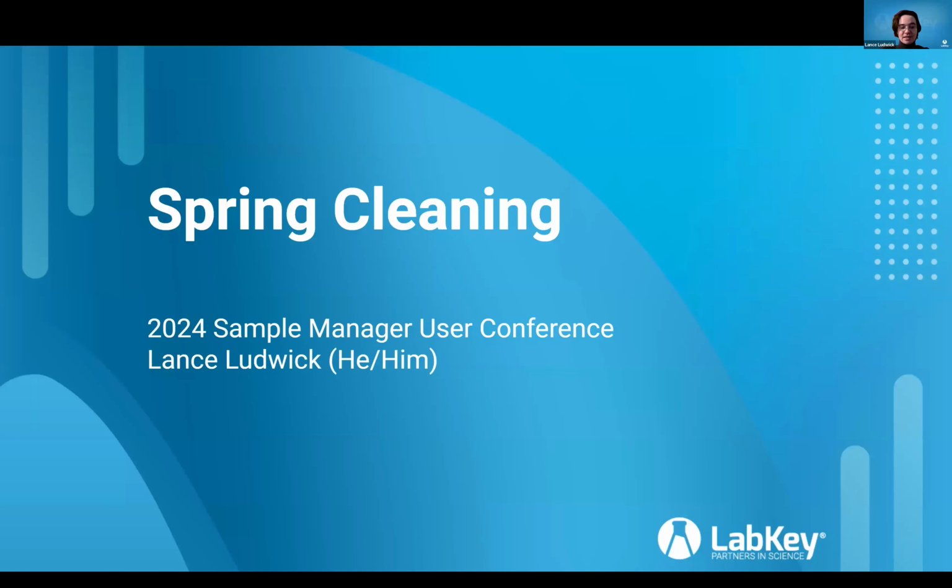I'm super excited to learn more about all of the different types of science that we help support, especially with Sample Manager. Today I'm going to discuss what I've learned from being onboarded on Sample Manager since I started last year in August, how it would have helped with my personal experiences, and how we can further help you with spring cleaning, making sure your lab is staying organized, and how Sample Manager can help out with that.